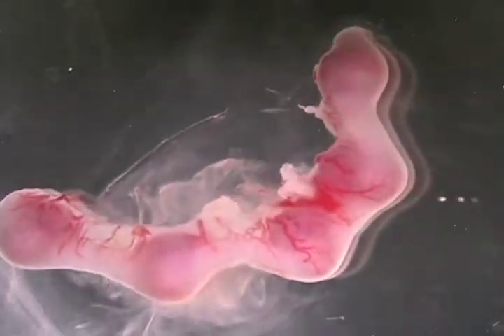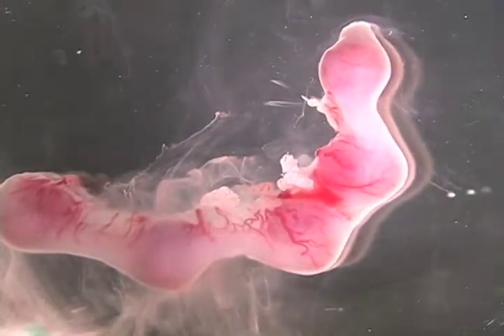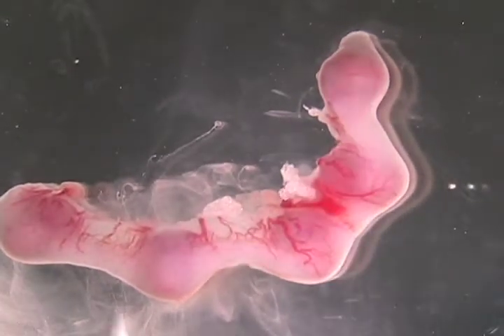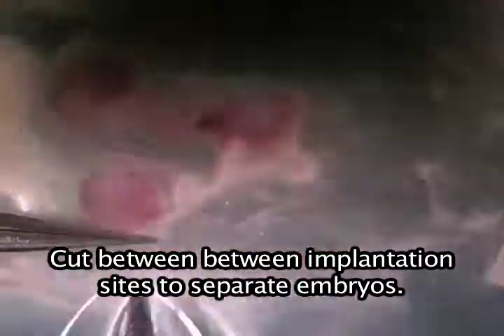So this is the uterine horn; these are the implantation sites: 1, 2, 3, 4, 5. What you want to do is just separate them — you can basically cut between the implantation sites right here.